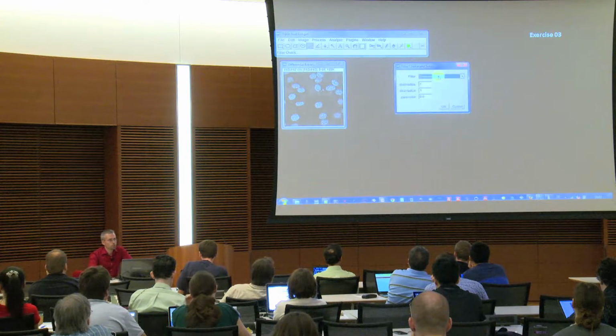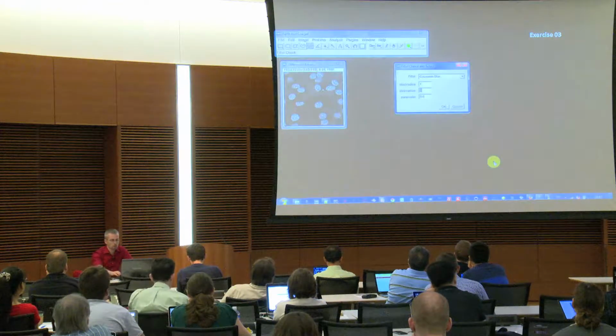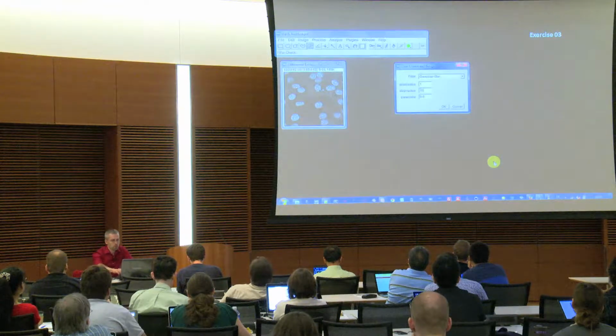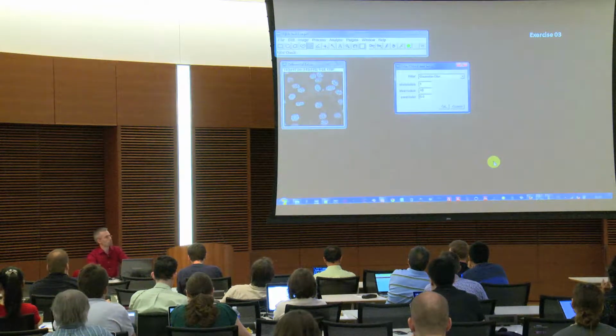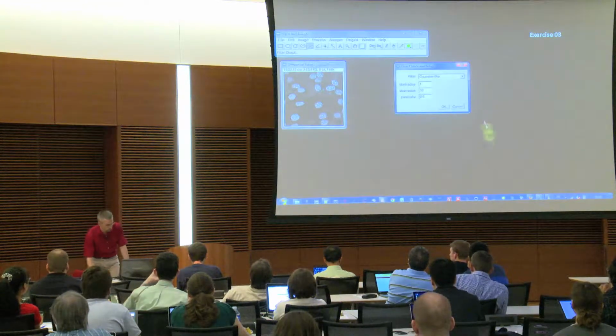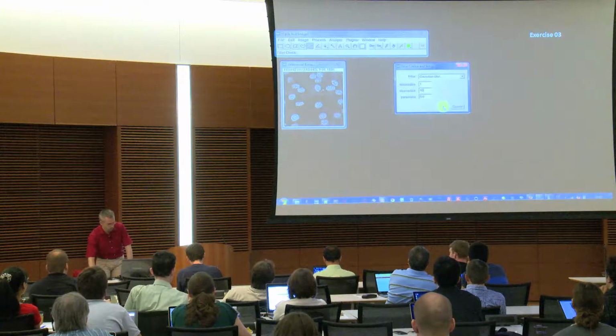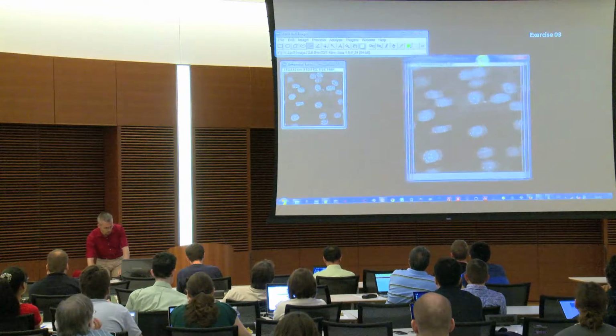then we simply test first the Gaussian blur. Start with a radius of 1 and do it up to a radius of 10. Mostly you don't need such high radii, but just to show you the comparison. The parameter is not necessary here, so we ignore that. So if I press OK, I will get a stack.